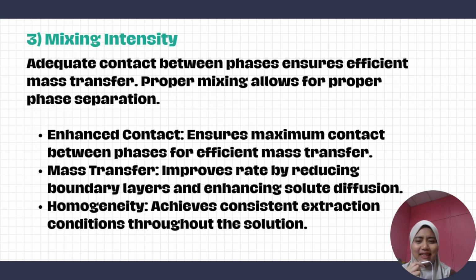So, how can mixing intensity affect the LLE process? First, enhanced contact, to ensure maximum contact between phases for efficient mass transfer. Next is mass transfer, which can improve the rate by reducing boundary layers and enhancing solute diffusion. And third, homogeneity. By mixing, it can achieve consistent extraction conditions throughout the solution.